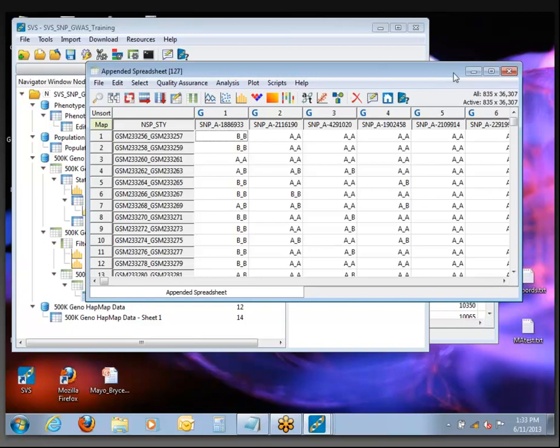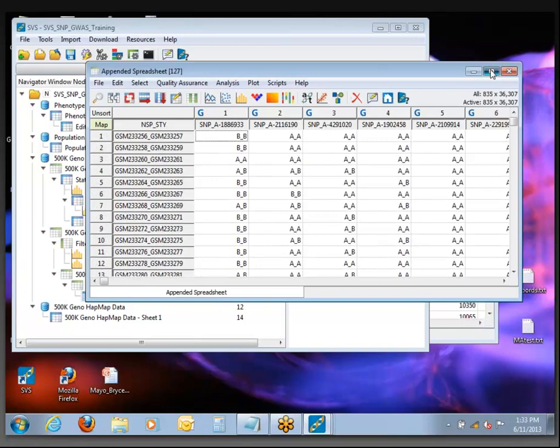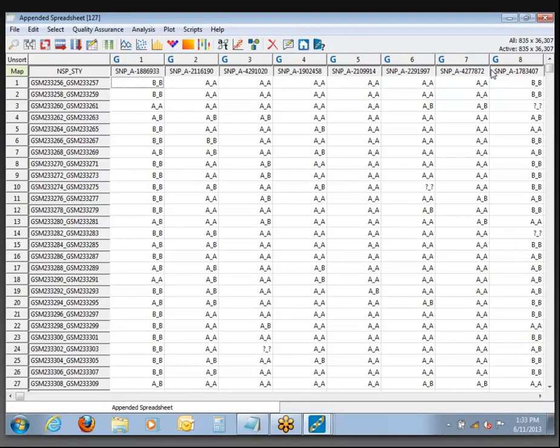Mine is finished. I have 835 rows instead of 565 — so we've added in those additional 270 samples. If I scroll down I can see they're all down here at the bottom. One warning: you can't be too cavalier about joining up data sets like this. If you have genotyping done at different times in different places — even if it's on the same chip — one thing to really be aware of is whether or not the alleles were called on the same strand. Sometimes you'll join these and find four different alleles for every SNP because they're done on different strands.